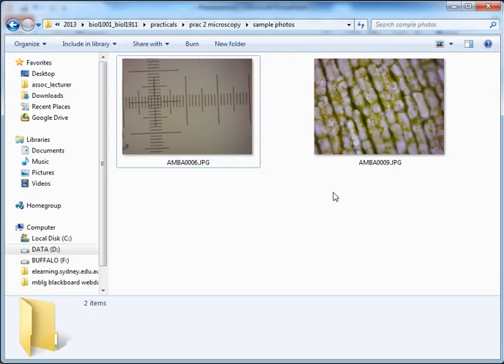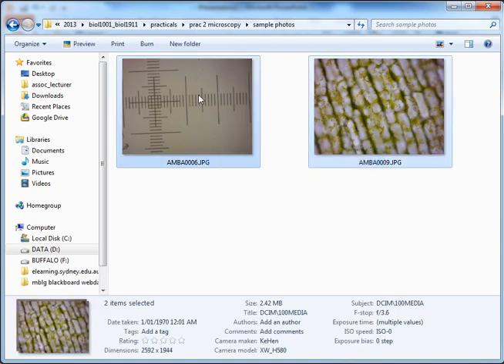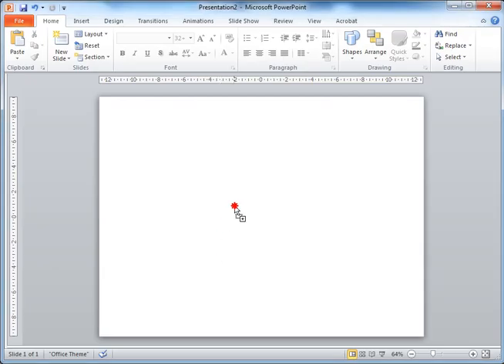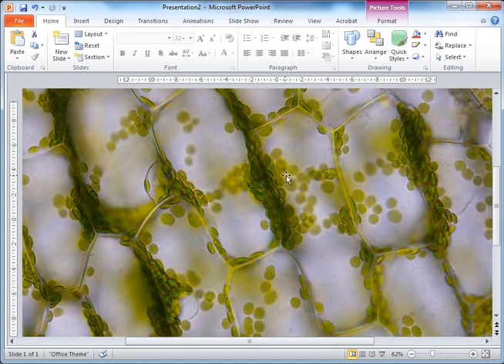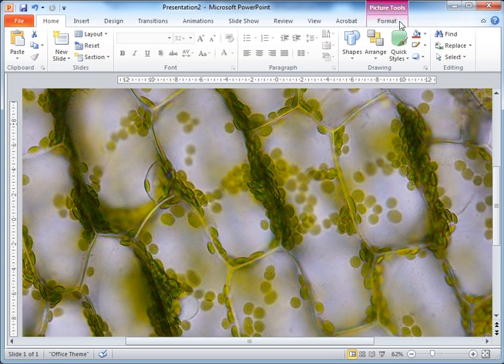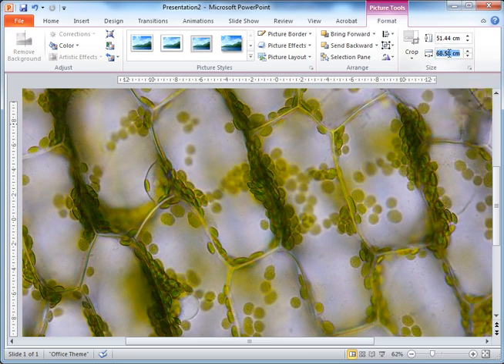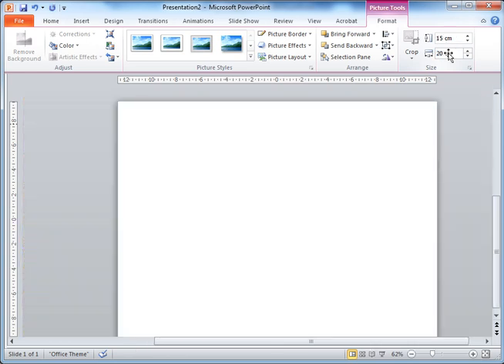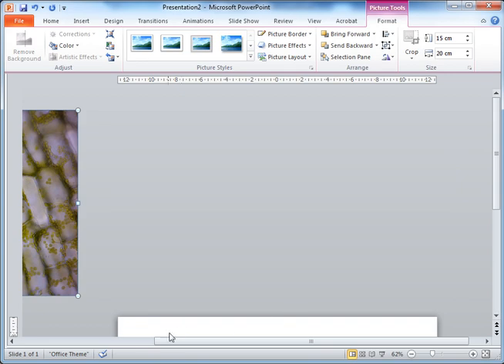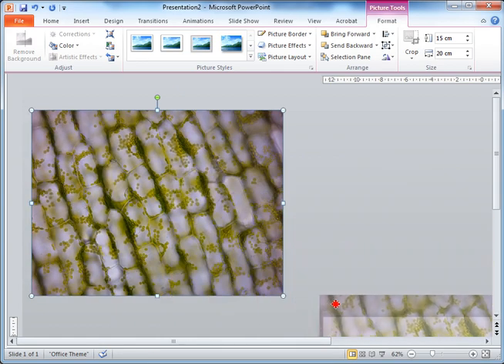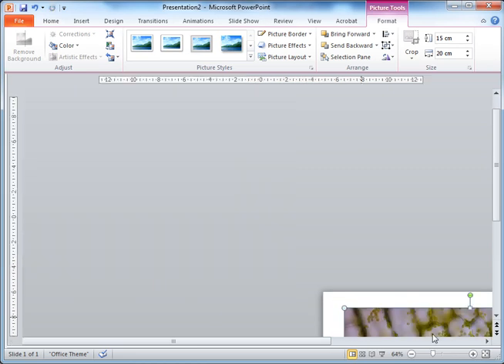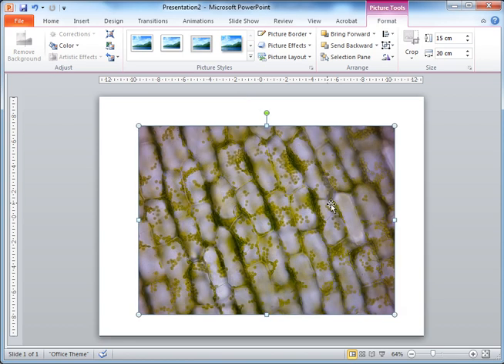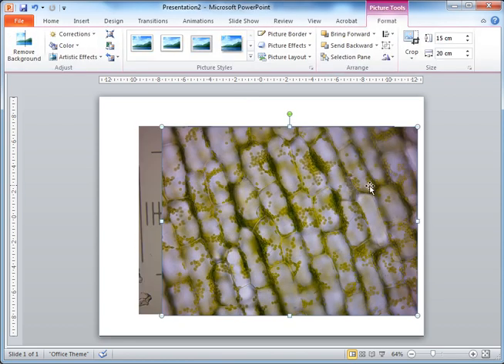We'll go back into our sample photos and drag these two files into the PowerPoint window. You'll notice that PowerPoint opens the images very large, so the first thing to do is shrink them down. In the Picture Tools Format tab, set the shape width to about 20 centimeters and hit Enter. That will shrink the images down — they'll probably be hiding in the corner, so scroll up and bring them into view.